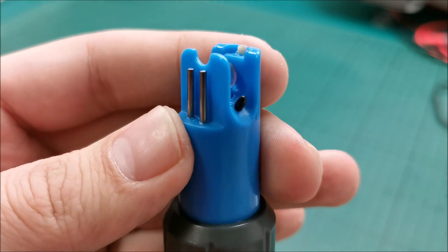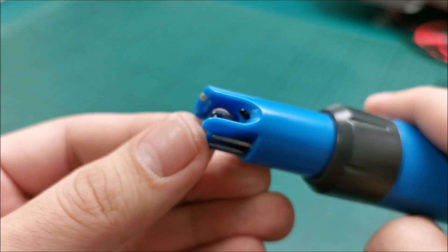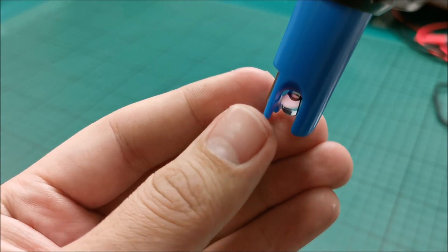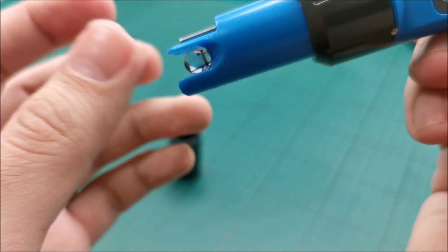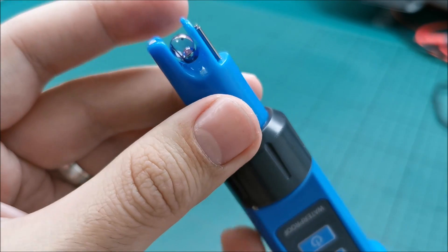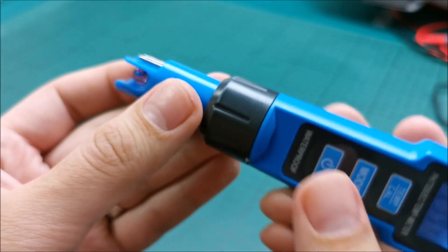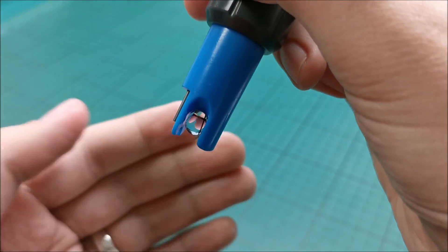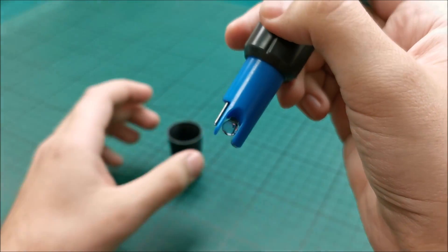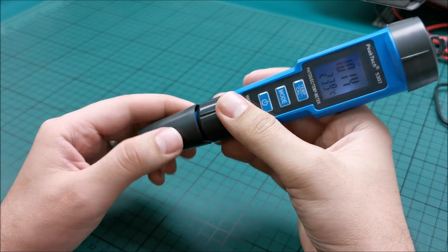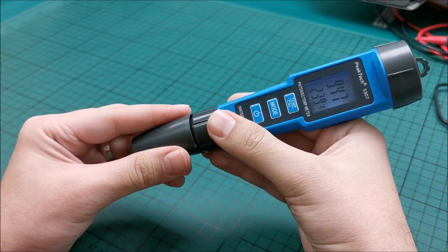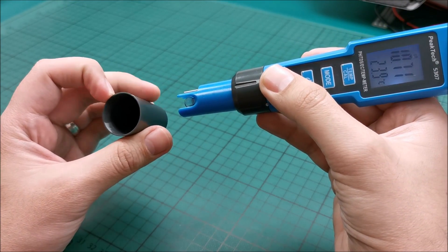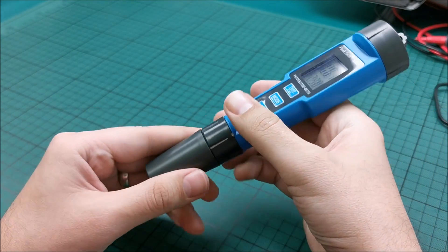Something cool that I just noticed, this little glass bead has a liquid in it and oh come on move around, you can see also bubble in there that's moving around. So somehow a reaction happens there. You can also see a tiny wire that makes it able to read the pH level. So we have a way of actually putting this in, or no I think it's universal, yeah it's universal.